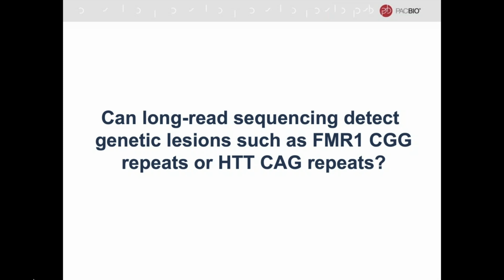So that's G4C2 900 times. And we were able to sequence through it with a single PacBio read for the very first time that we know of. And again, getting a little bit towards the low complexity or homopolymer question that was posed earlier, the fact that we can get through these types of regions speaks very highly for the stability of the sequencing across any genomic complexity in the genome.